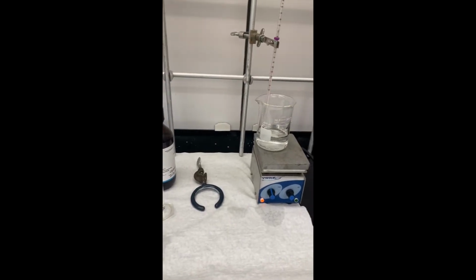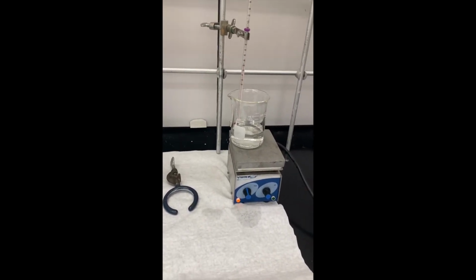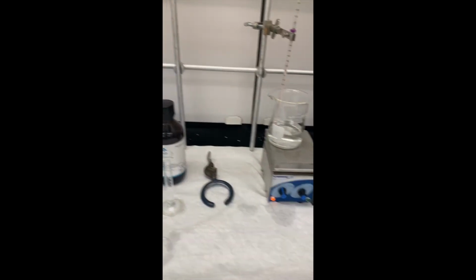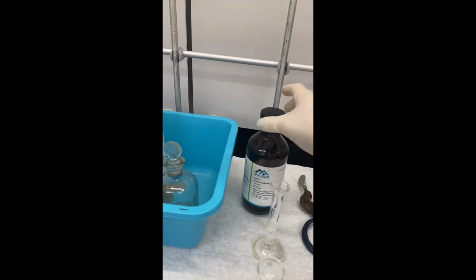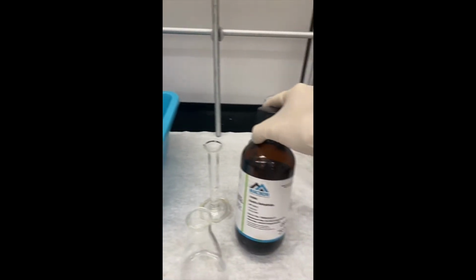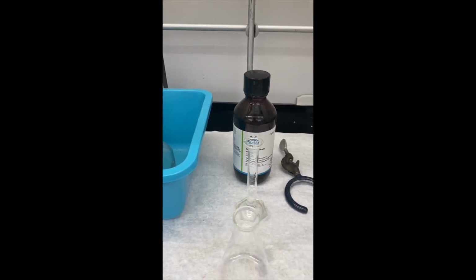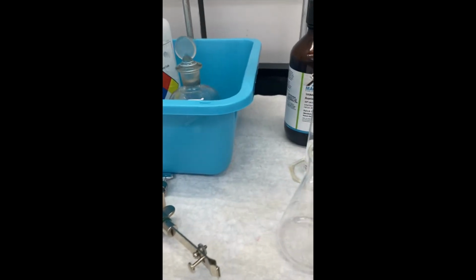So the experiment going on right now is the aspirin synthesis. It's a one-step synthesis starting from salicylic acid, and we're going to use acetic anhydride as our acylating reagent. So we've got acetic anhydride here. We want to add 5 mL of acetic anhydride to our salicylic acid.